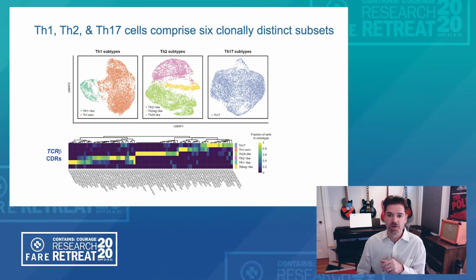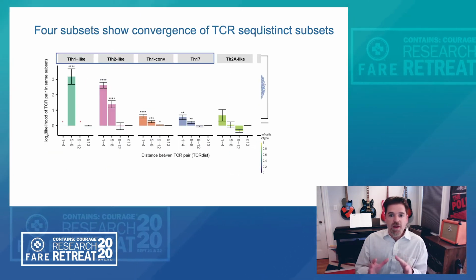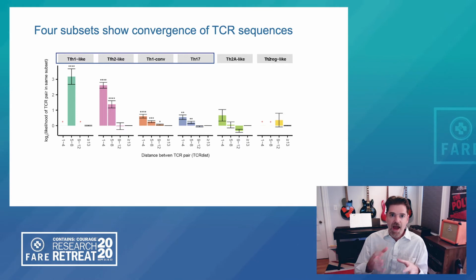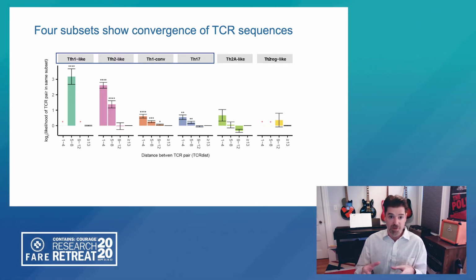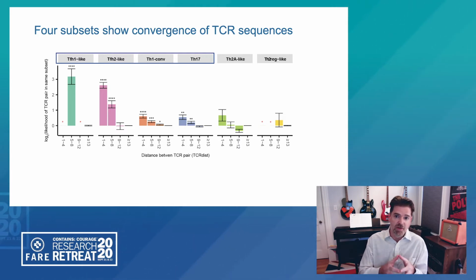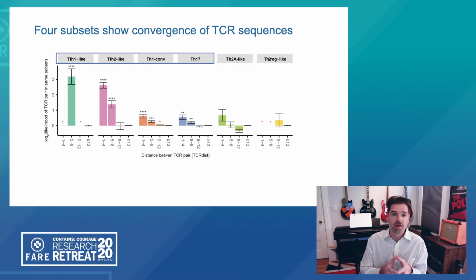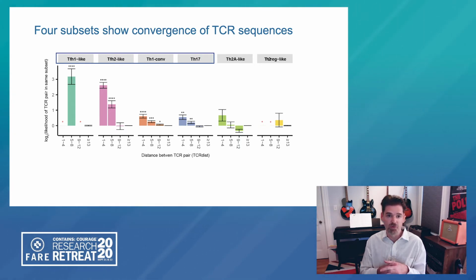are highly clonally distinct populations. One of the analyses that we wanted to do further on this particular question was to ask really, how do the TCRs relate to one another in those families? So looking explicitly now at the 6 types that we've just identified, we can ask, is there a high degree of relationship among the CDRs shown within the TCR sequences we've recovered?